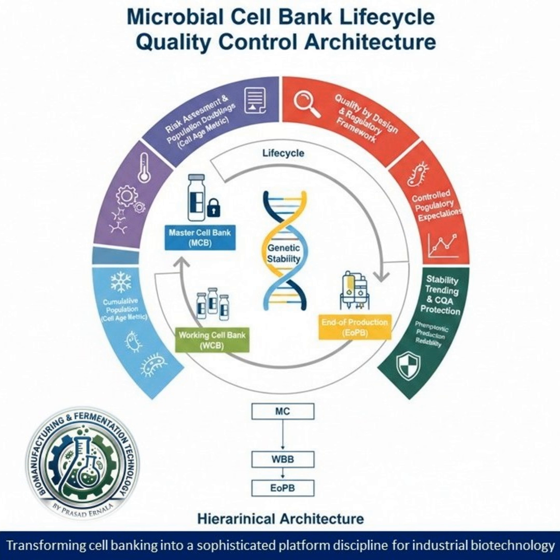Okay, that architecture really highlights the need for fidelity. But fidelity depends on knowing the true age of the cells. And when we say cell age, we don't mean calendar days, do we? Not at all. It's all about quantifying the proliferative history using cumulative population doublings, or CPD. And that's considered a critical process parameter. It is. We define age quantitatively as the total number of doublings from the moment the clone was first isolated all the way up to inoculating the final production vessel.